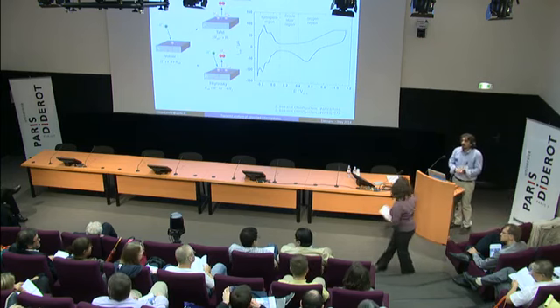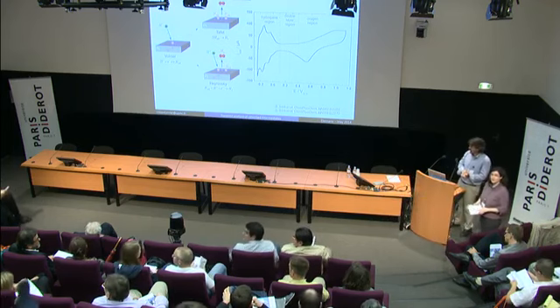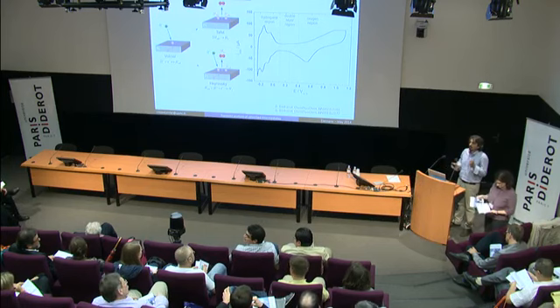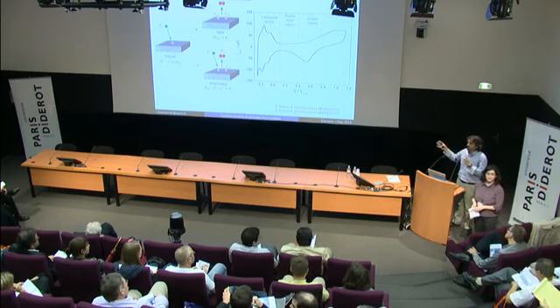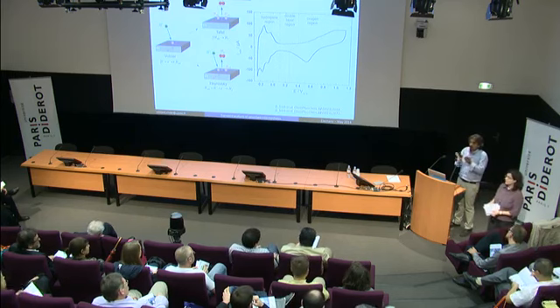What is the locality of your measurement? You say it's a localized impedance measurement. What is the local resolution? For which technique? Because for the scanning electrochemical microscope, I can use a nanoelectrode, so this can be done on a very small area. But that doesn't mean that your resolution in the image is as small as the probe, because you have a broadening of the diffusion fields and also the electric field distribution is broadening.